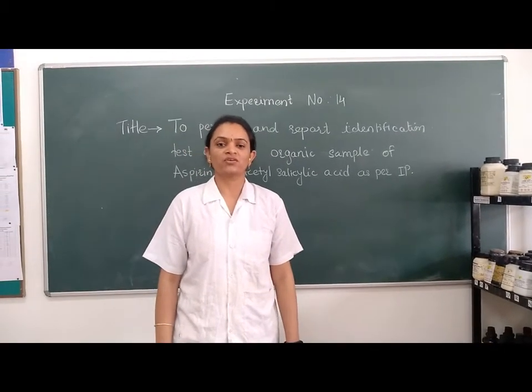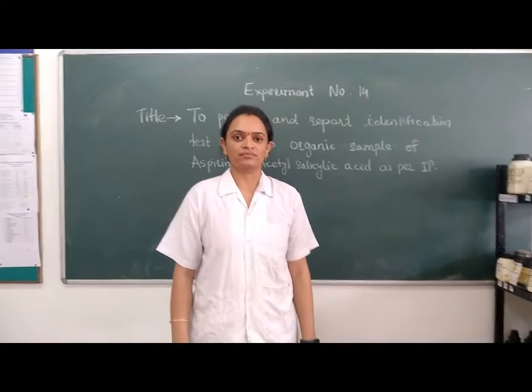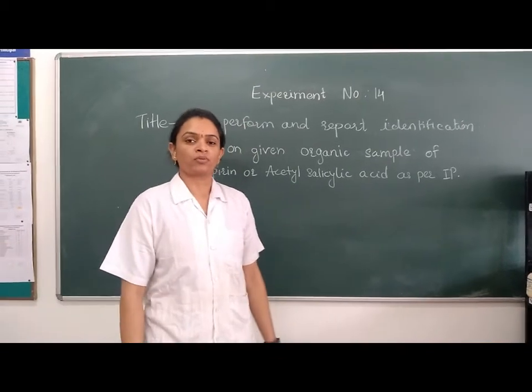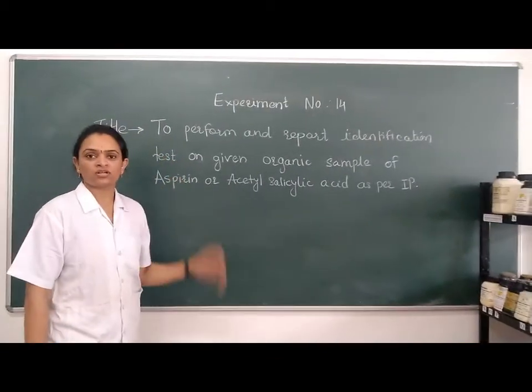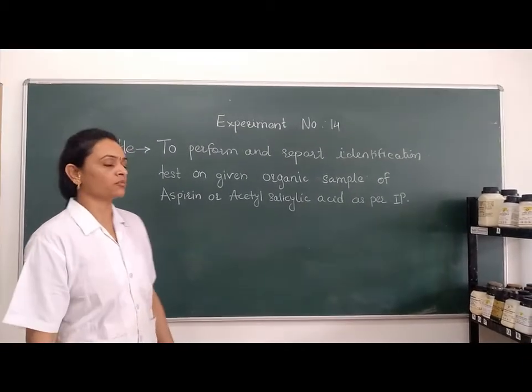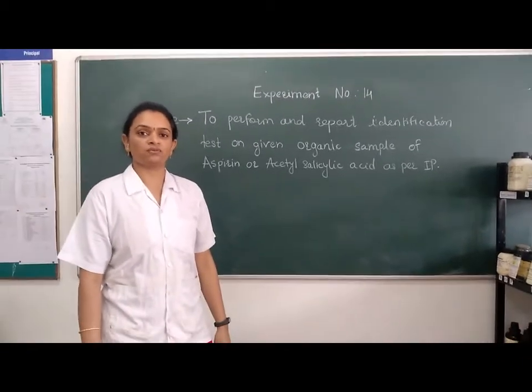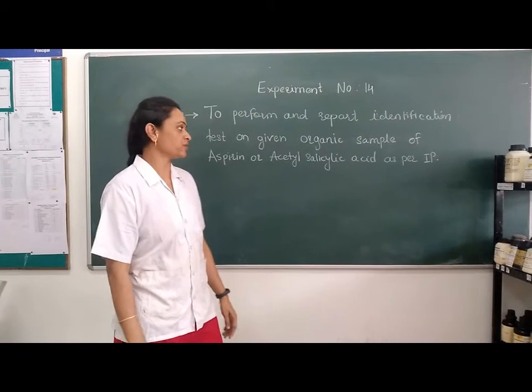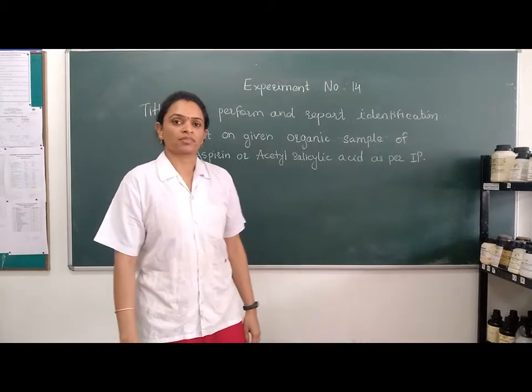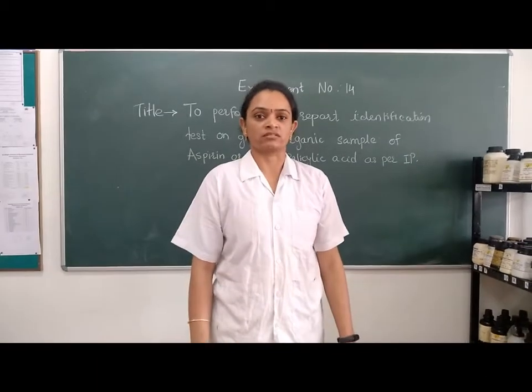Welcome dear student in our pharmaceutical chemistry 2 laboratory. Today we are going to deal with experiment number 14. Title of today's practical is to perform and report identification test of given organic compound of aspirin or acetyl salicylic acid as per IP. Let's move with procedure.